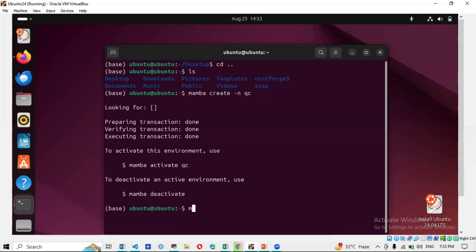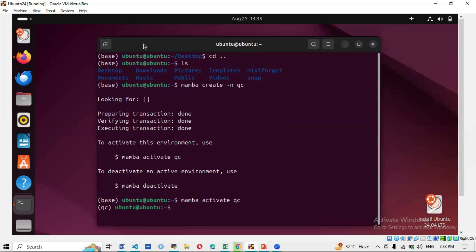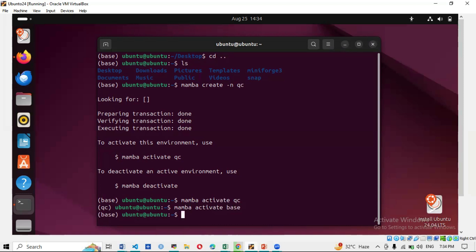After creating the environment, activate it with: 'mamba activate qc'. The prompt changes from 'base' to 'qc', meaning you can now install FastQC into this environment. When you want to use FastQC, activate the qc environment and proceed with analysis. To deactivate, run 'mamba activate base' — the environment returns to base.